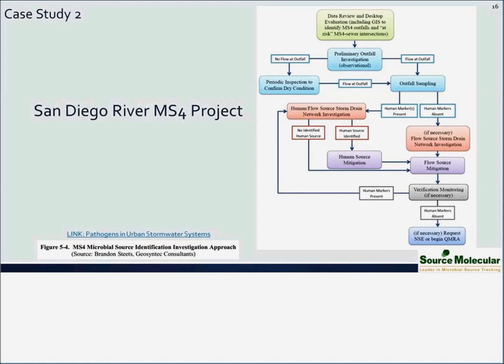Okay, can you please talk about current costs, including comparison of digital PCR and qPCR? Well, qPCR is theoretically cheaper because people have the equipment already. Like us, we already have the equipment. Digital PCR has this big upfront capital cost. But then in the long term, what I understand is that the per sample cost goes down. But you have to pay for these big expensive machines at first. So we're charging about the same for larger projects.